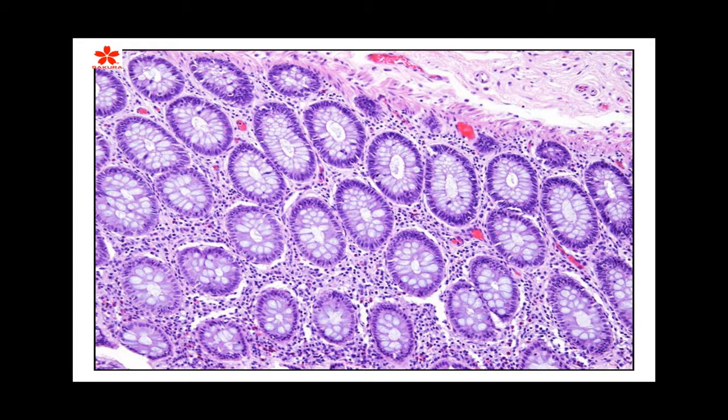So what we have here is two different slides that I just showed you. And the question is, which is the more optimal stain? Well, that is a matter of preference. It's very subjective based on who the reviewer is. Many of you have pathologists that are very preferential about how they like their H&Es.